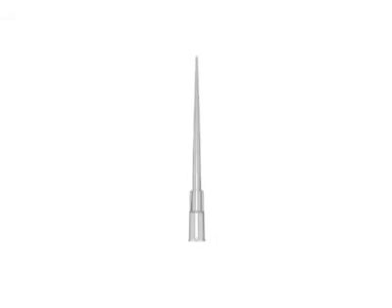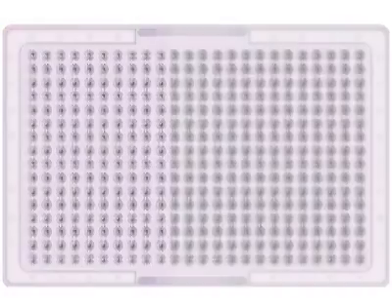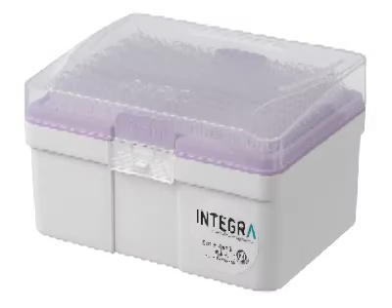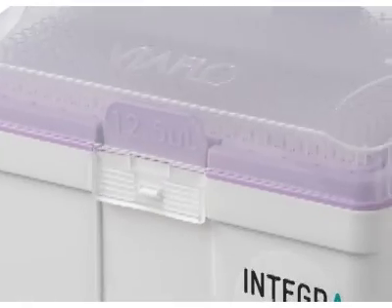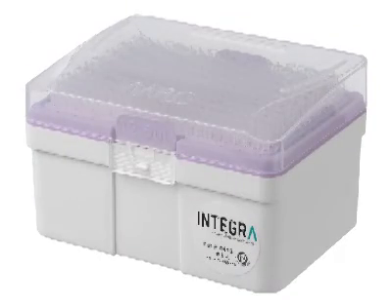Integra's smallest grip tips — 12.5 microliters and 125 microliters — are packaged in conventionally dimensioned racks. However, unlike other SPS racks on the market that hold 96 tips, our racks contain 384. This allows the same tips in the same rack to be used with a single 8, 12, or 16-channel pipette. No longer do you have to use separate tips for 96 and 384-tip pipetting. By offering four times the number of tips in the same amount of space, Integra grip tip racks also offer dramatic savings on shipping costs and inventory space requirements.